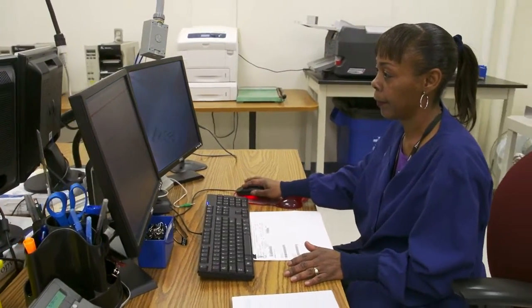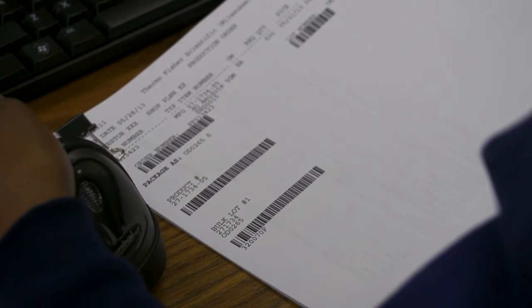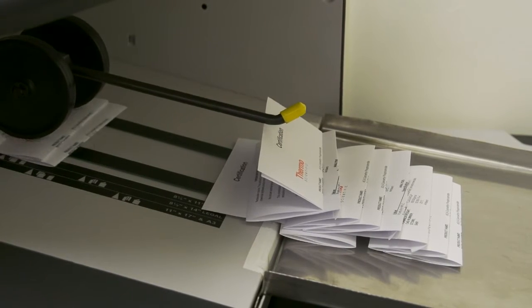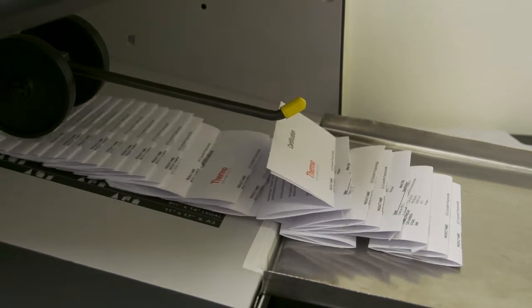But our focus on quality doesn't end with manufacturing. In fact, it extends through final delivery to our customers, including Certificate of Analysis and Label Production, where error-proofing mechanisms ensure customer-specific requirements for product literature are met.